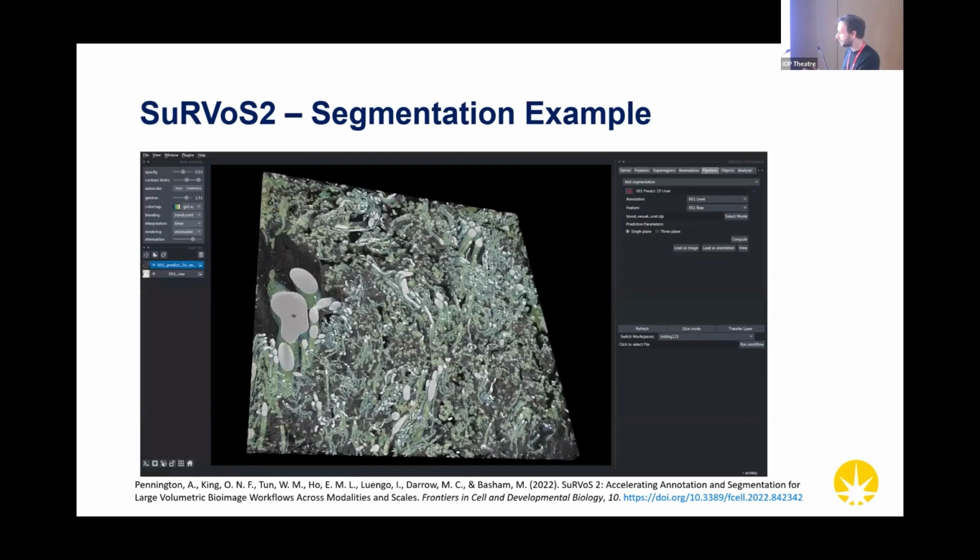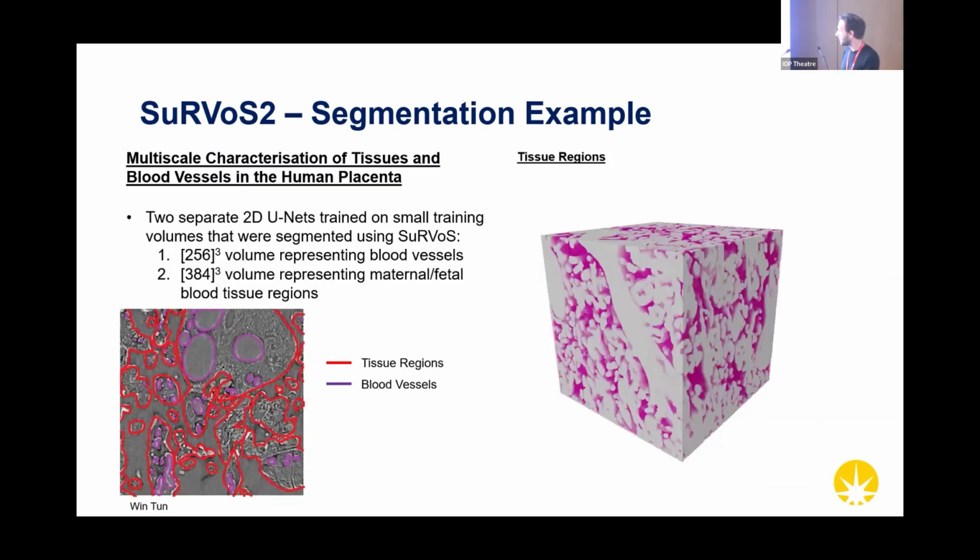And then you can view it in the viewer. You can do some rendering. Sorry about the color scheme, it's not the best.